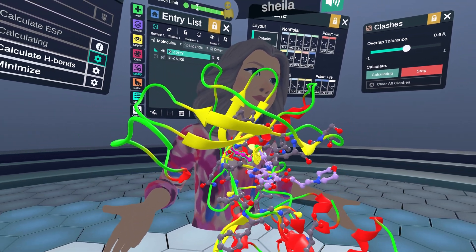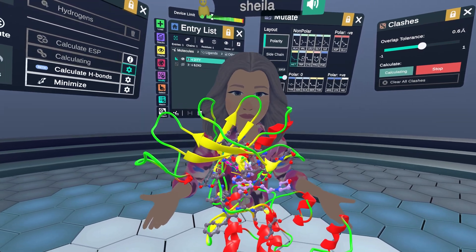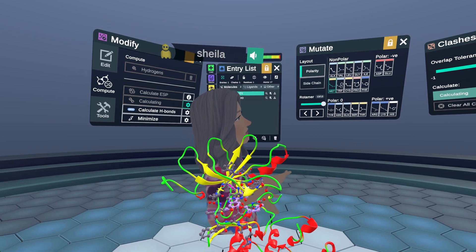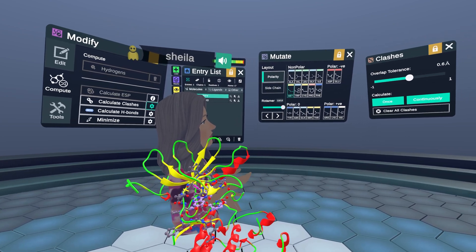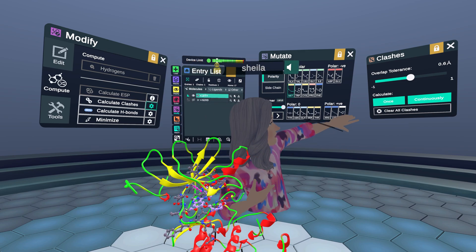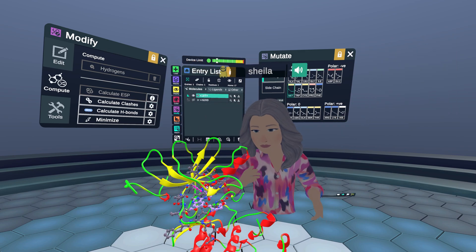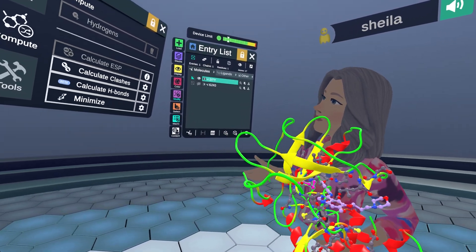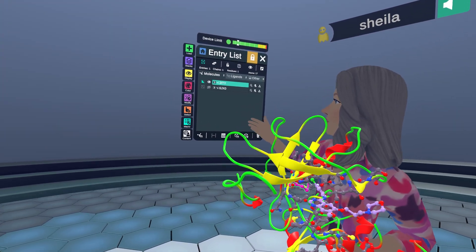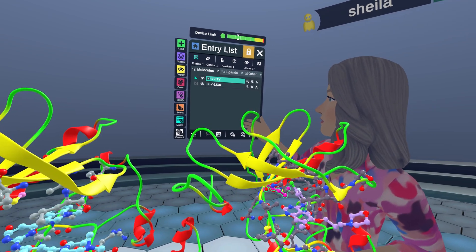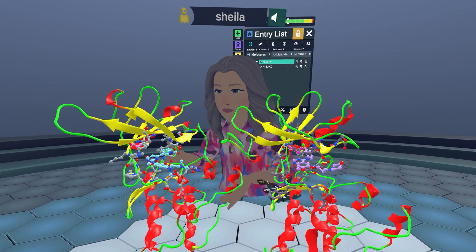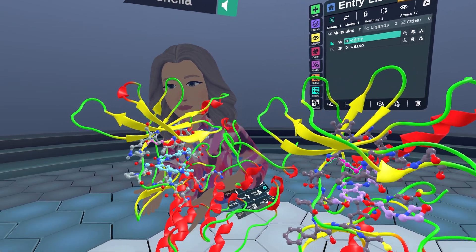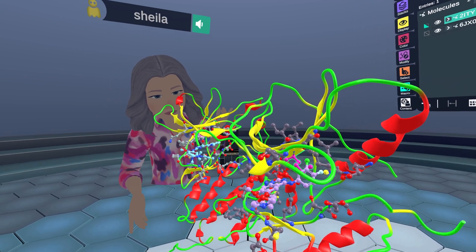I invite you to come and interact with the tutorial and scroll through these rotamers — it's a fun exercise. I'm going to stop calculating these and clear the clashes so we can see everything clearly again, and close out the mutate and modify menus. I already have in the space a crystal structure of the actual T790M mutant with an irreversible inhibitor bound.